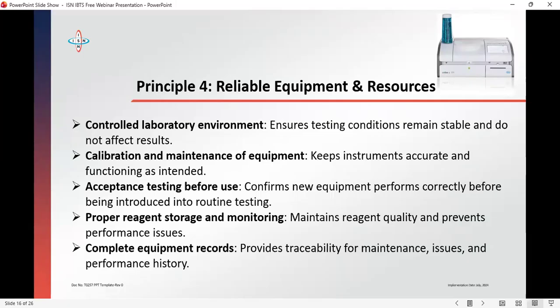My house is not a lab that is testing and issuing out results that somebody will use for somebody's life. The lab needs to keep all the documents. Every single piece of information on the instrument, including the manual, must be kept, because if a proper auditor comes to your lab, they are going to check it.